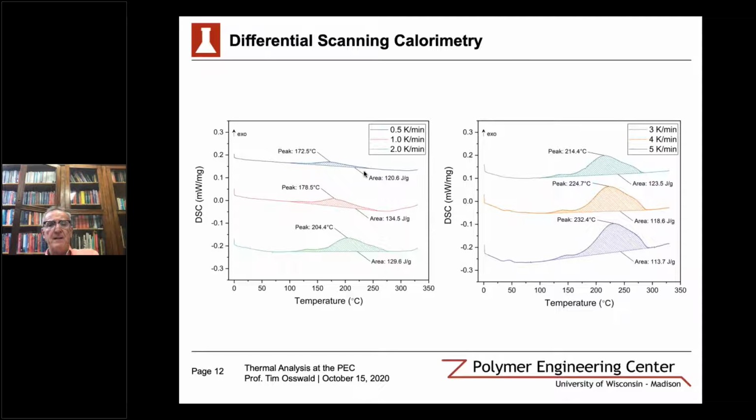It's very interesting. Here we basically just capture one general autocatalytic reaction, but as we speed up the process, we start recognizing two shoulders, at the beginning and at the end, which represent two other reactions. So you can see a general reaction, which is the general hump, and then a shoulder here and a shoulder here at the beginning.